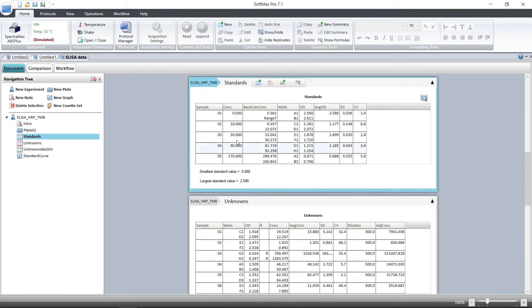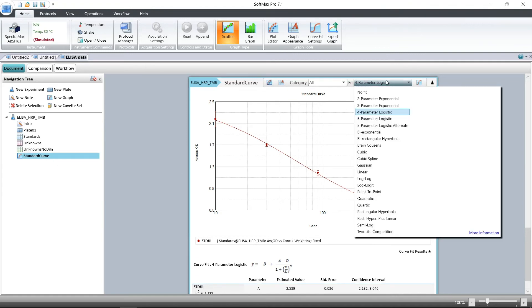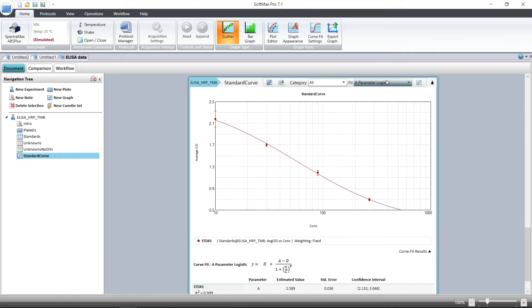We also see the concentration, OD, average standard deviation, and CV. This is used to construct the standard curve. There are many different standard curve fits available in the drop-down menu. Choose the one that suits your data the best.